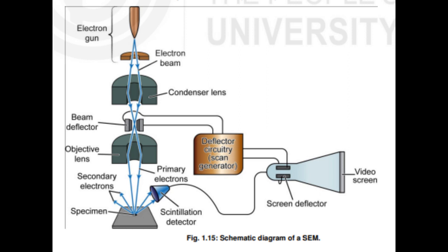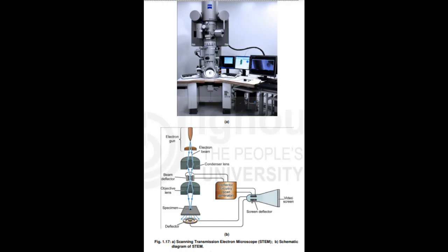3. The specimen is dehydrated by treating it with 25% ethanol for 10 minutes, 50% ethanol for 10 minutes, 70% ethanol for 10 minutes, 85% ethanol for 10 minutes, 95% ethanol for 10 minutes, and 100% ethanol for 10 minutes. 4. The automated process of critical point drying is carried out for 40 minutes. 5. The sample is mounted on a metal stub with double-sided carbon tape. 6. The sample is coated by applying a thin layer of metals, gold and palladium, using an automated sputter coater.